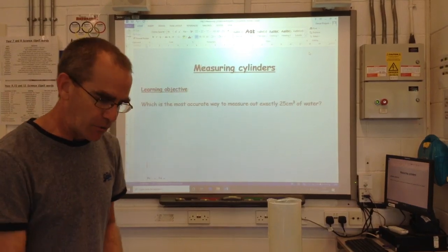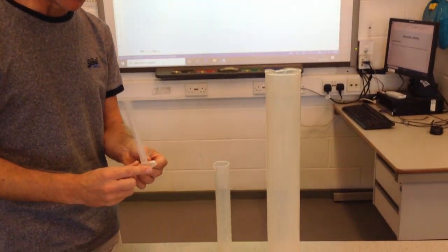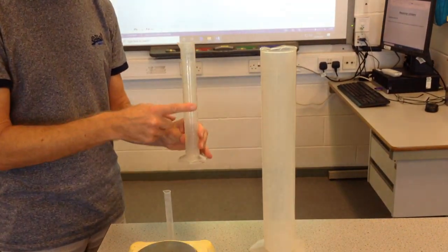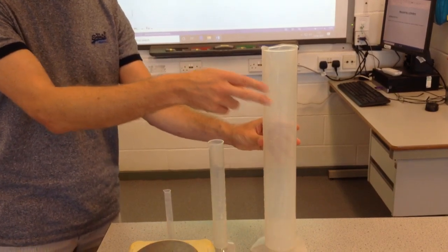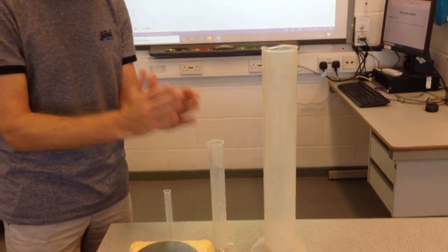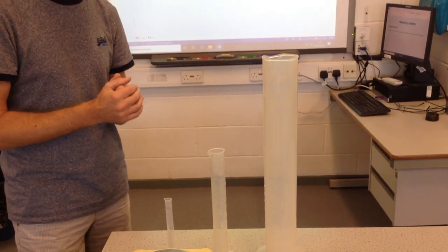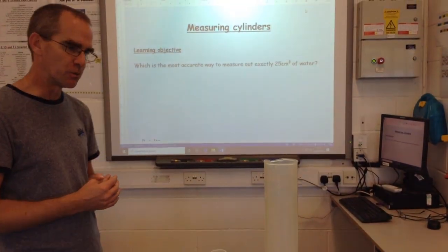The three measuring cylinders I'm going to use today are: this one — a 10cm cubed measuring cylinder, it can only hold 10cm cubed — a 100cm cubed, and a 1000cm cubed. I'd like to know which of those is the best to use if I need exactly 25cm cubed of water.